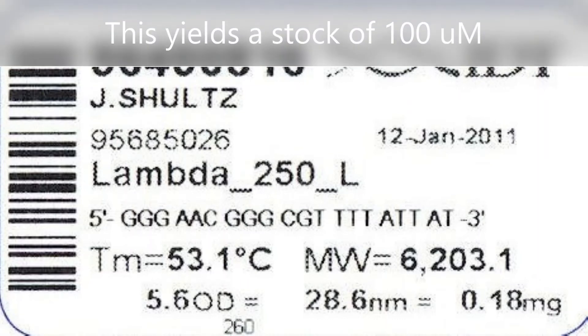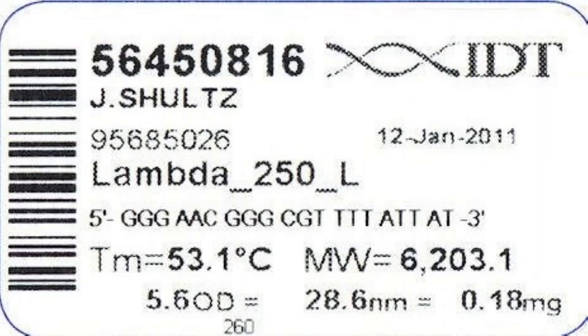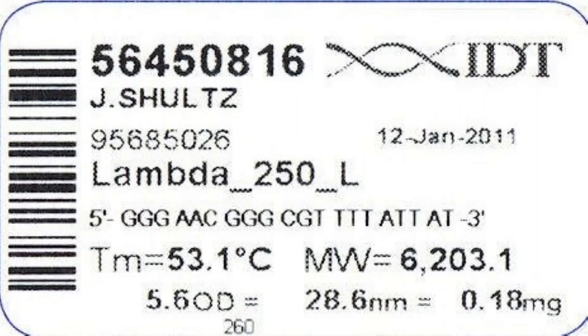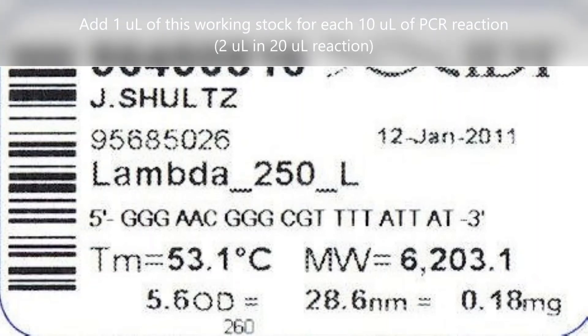This stock is then diluted 1 to 10 to make your working stock of 10 micromolars. This working solution is added to your PCR reaction so that the final dilution of primer is 1 micromolar. This means that a 20 microliter final volume PCR reaction includes 2 microliters of 10 micromolar working primers.